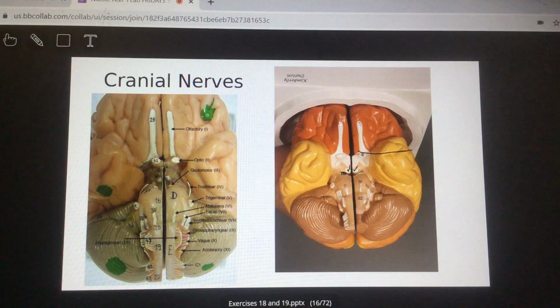Because this is the optic nerve. This right here is the optic nerve. Now, when we get to the sheep, you're going to see that what we're talking about here is an X at the optic nerve. There's an optic nerve, which is this. There's an optic tract, which is the bottom part of the X, and then there's an optic chiasm in between there. That's what we talk about. But most of the time, we're going to go to this area, and you're just going to tell me optic nerve, chiasm, tract, comma, comma, comma.